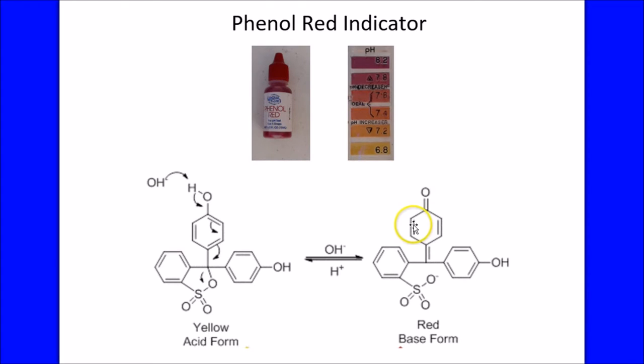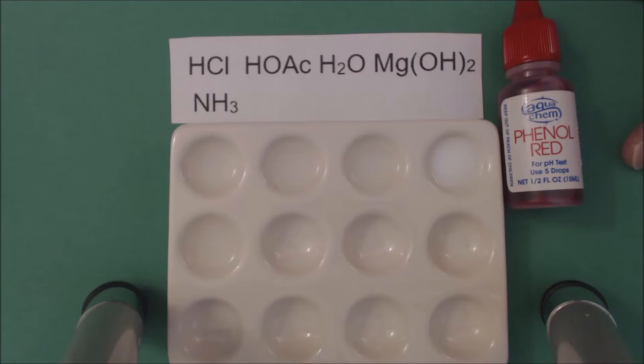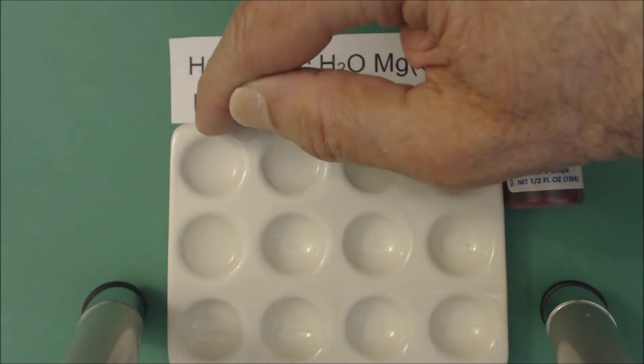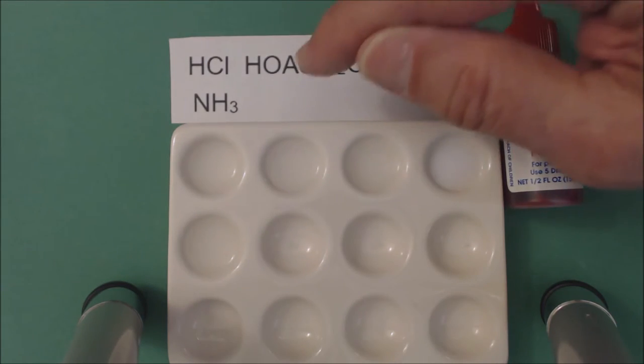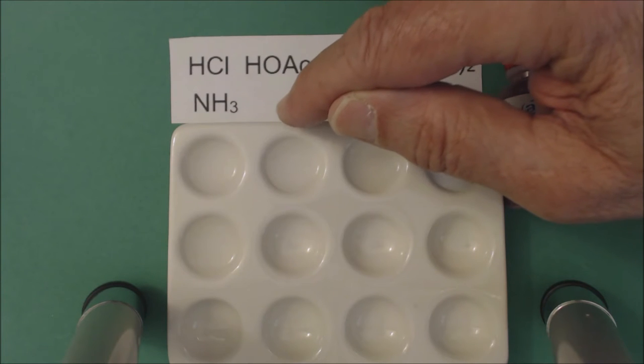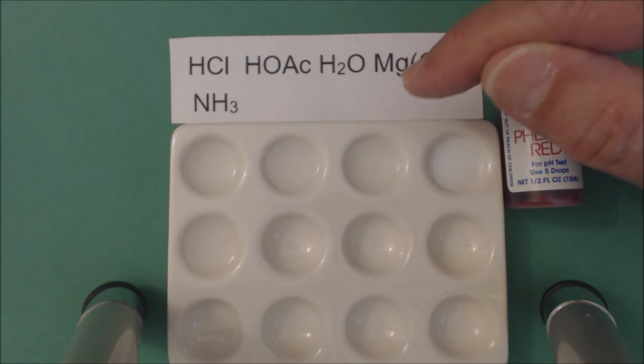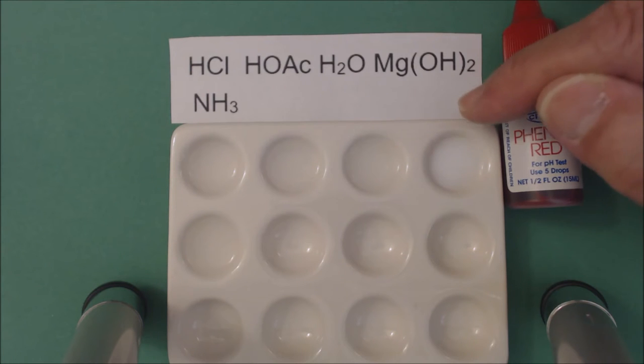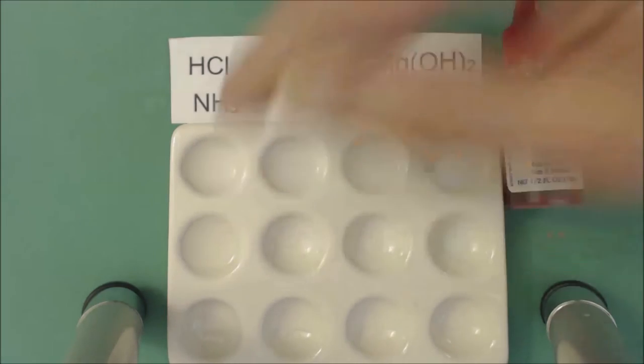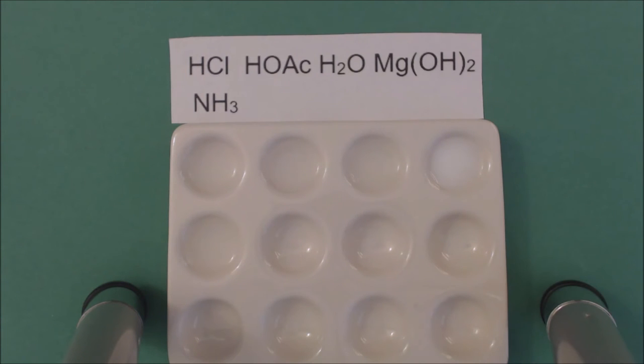In the next part, I'm going to show you how it works. Okay, we have five solutions here. We have 0.1 molar HCl, we have vinegar—just household vinegar—tap water, milk of magnesia which is magnesium hydroxide suspension of solid magnesium hydroxide in water, and down here we have household ammonia.